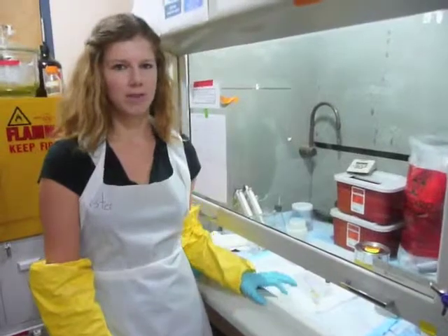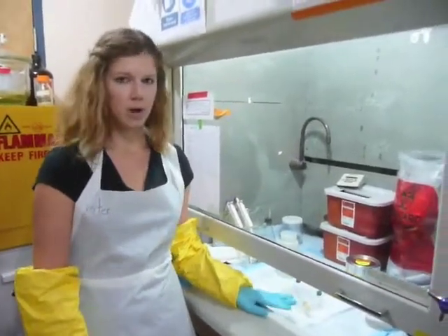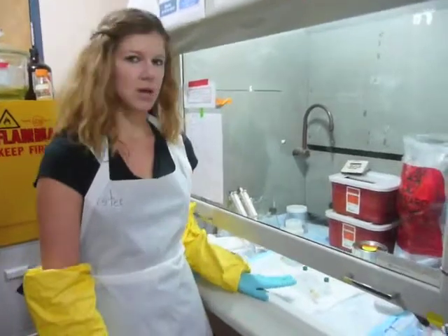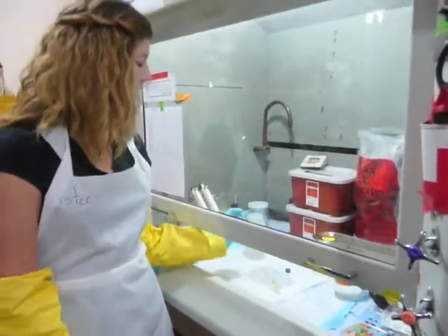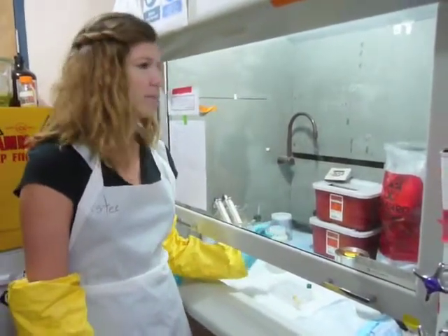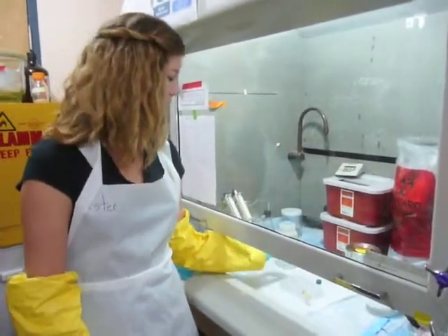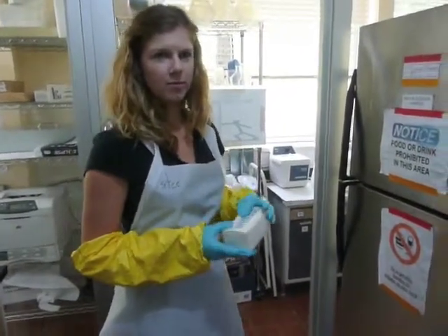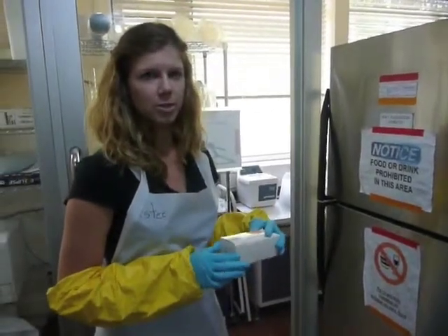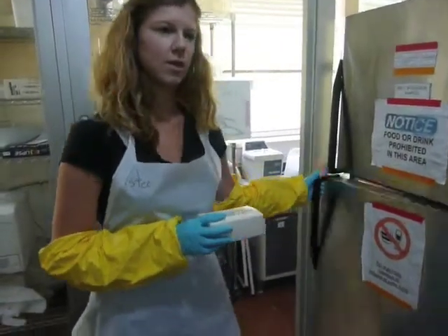Now we move on to fixation in osmium tetroxide. We add sodium bicarbonate to the osmium tetroxide in a one-to-one ratio, and we end up with 2% osmium. We take out as much of the water as possible from the vial of larvae and add about 1 to 1.5 milliliters of the osmium tetroxide. We leave the osmium to fix in the fridge for one to three hours — it allows the osmium to permeate the cell membranes and creates an electrically conductive surface for the electron microscope.